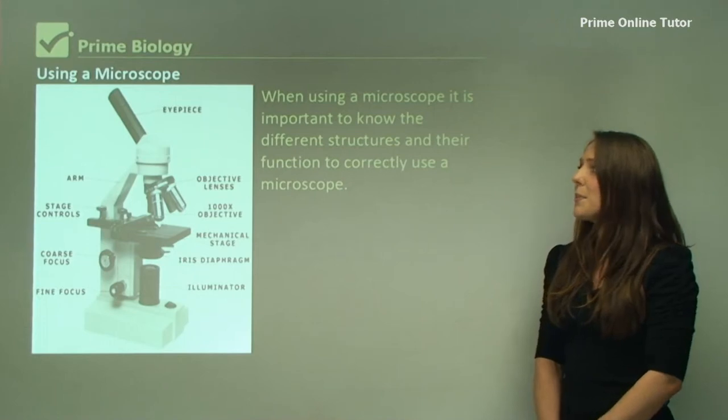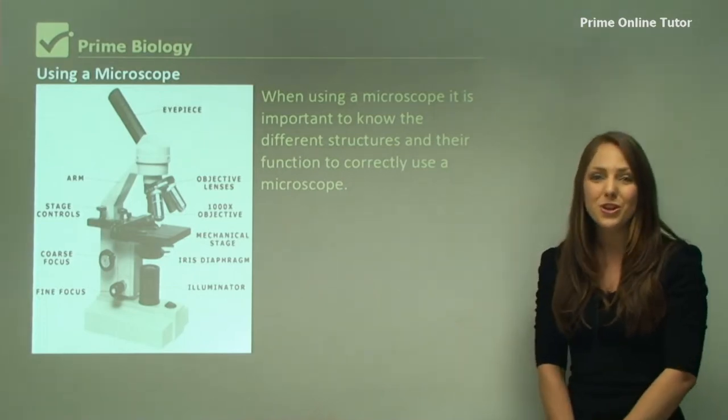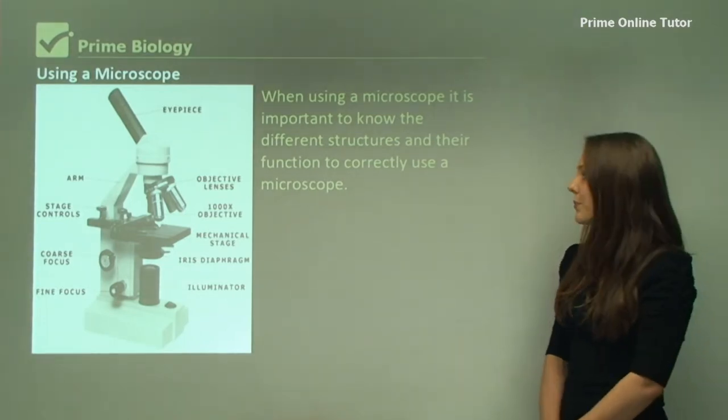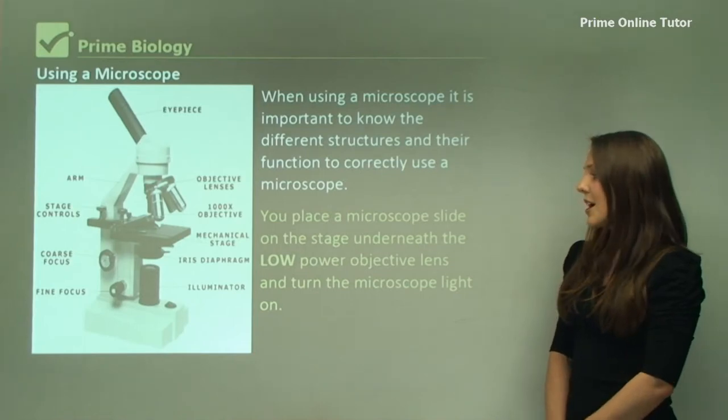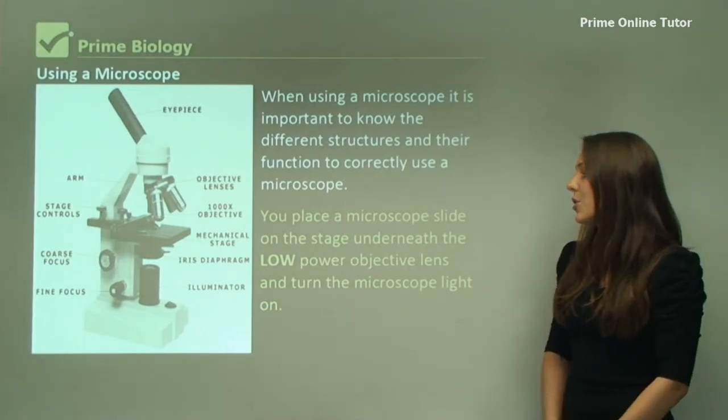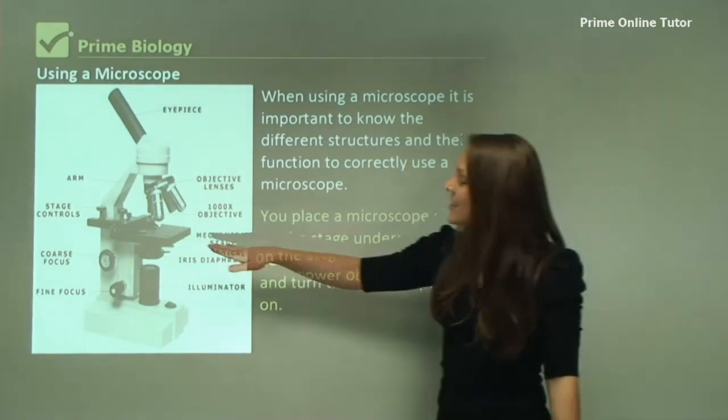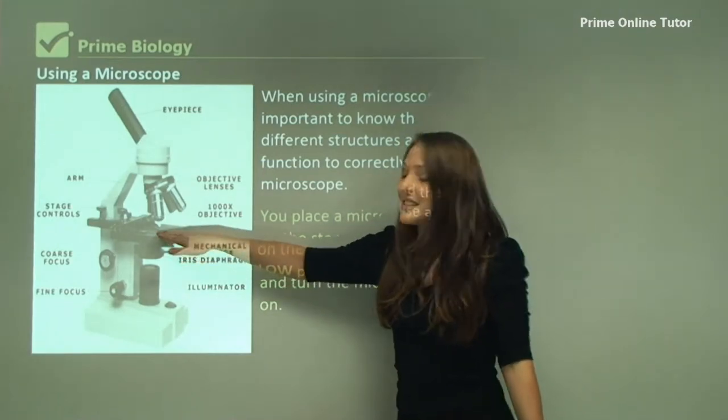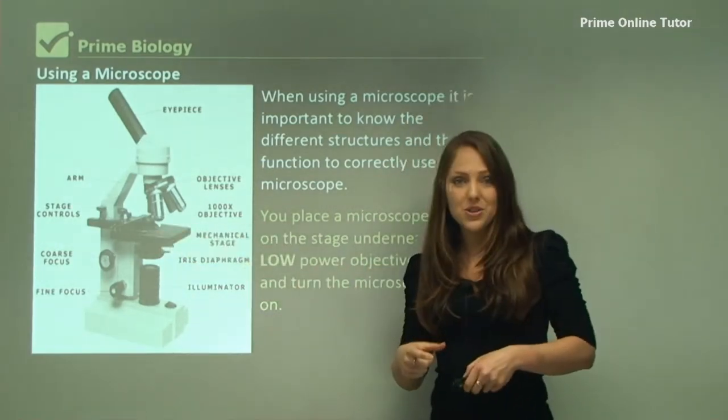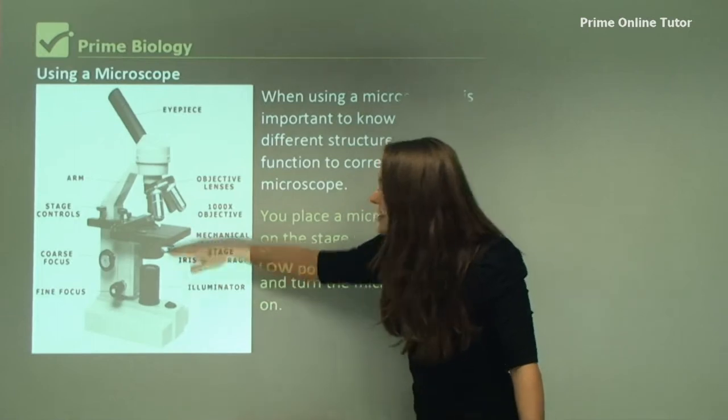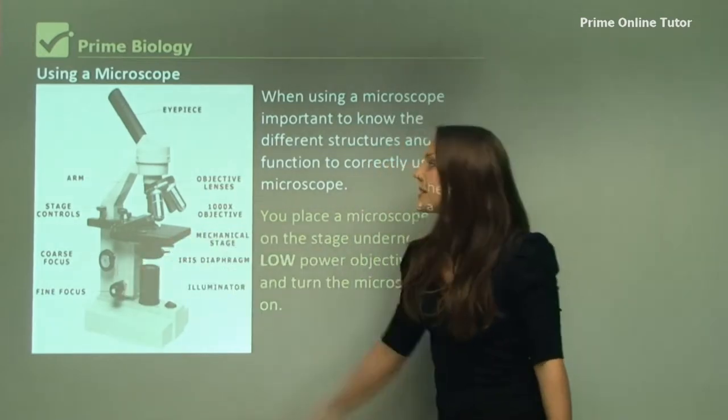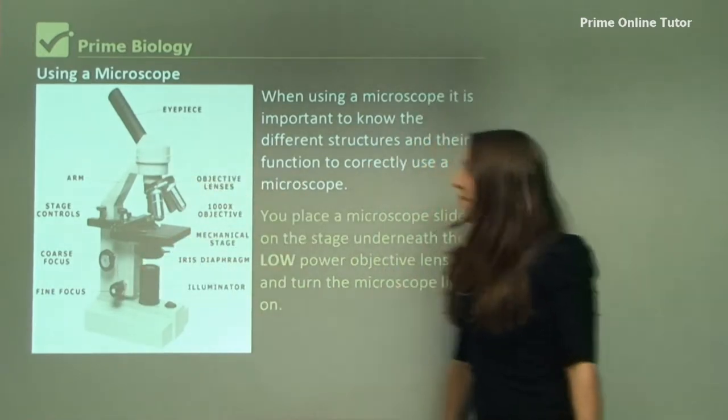When using a microscope, it is important to know the different structures of the actual microscope. You place a microscope slide on the stage underneath the low power objective lens. This here is the stage, and that's the platform where you can put your microscope slide. You can move this stage with the coarse focus, and you look through the eyepiece lens.